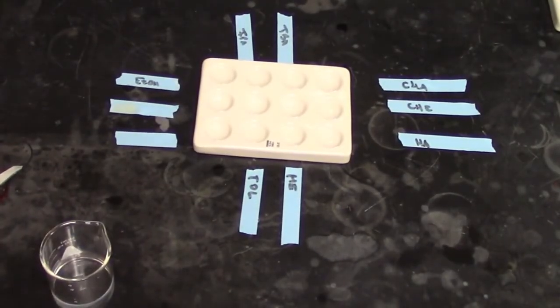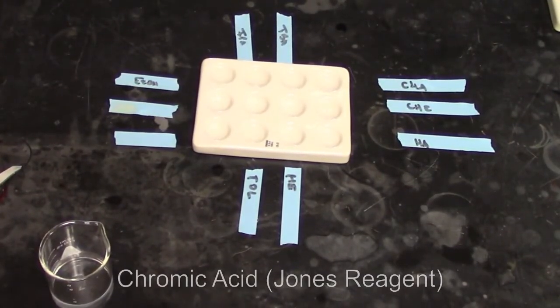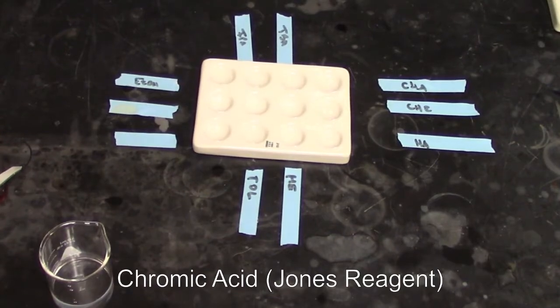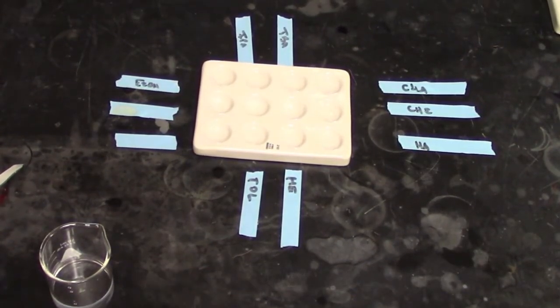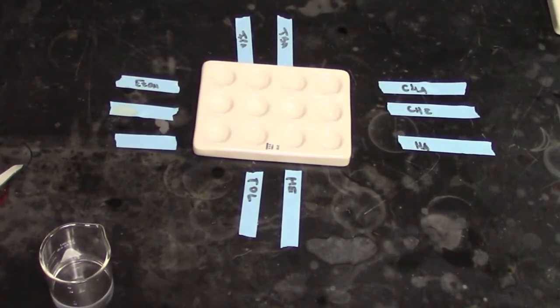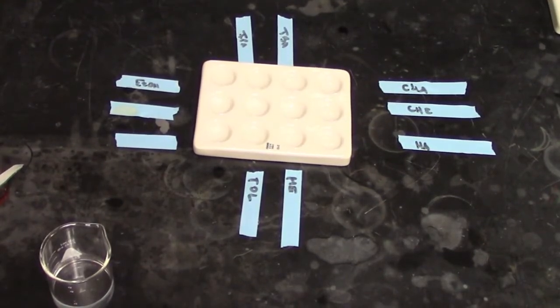All right, our next test here is going to be the Jones Reagent test. Now this is chromic acid and our chromic acid here is going to start as a nice deep orange color. Any reaction with Jones Reagent should shift us to a green color.